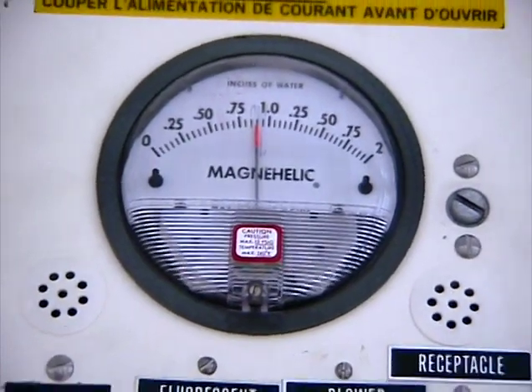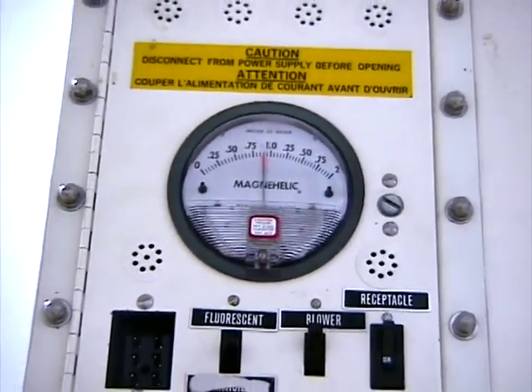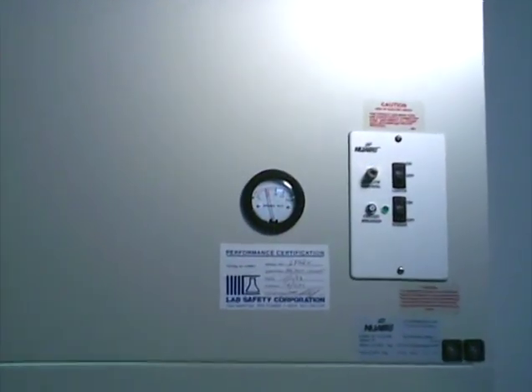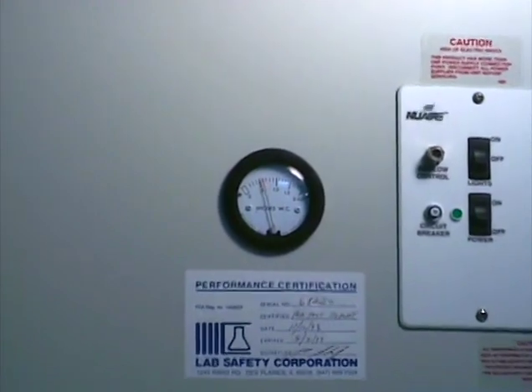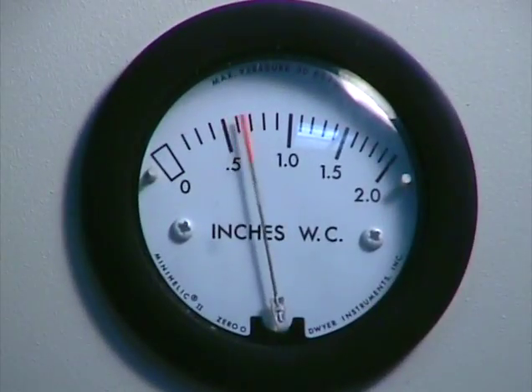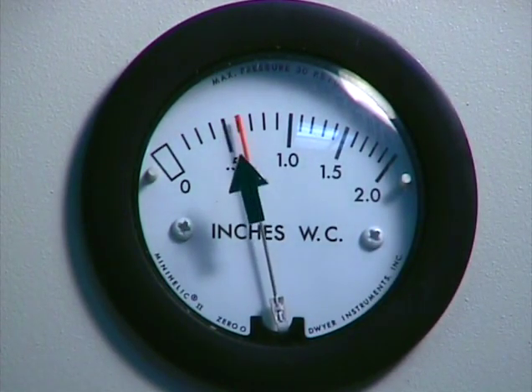Many LFCBs and BSCs are equipped with a magnehelic pressure gauge. While this gauge cannot be used to assure proper performance of the hood, it can be used to verify that the fan is operating and that no radical change in performance has occurred since the last performance test. It is recommended that, following a successful performance test of the unit, the tester mark the face of the gauge to indicate the acceptable operational range.